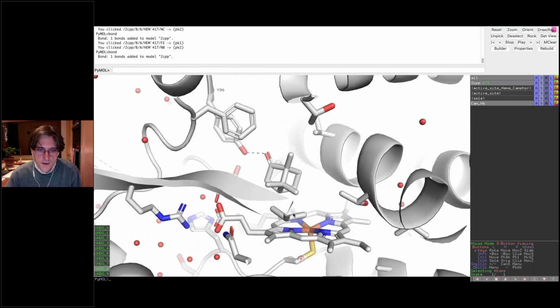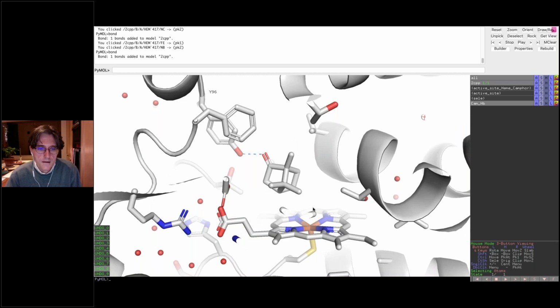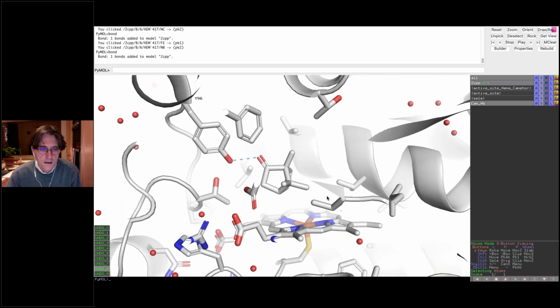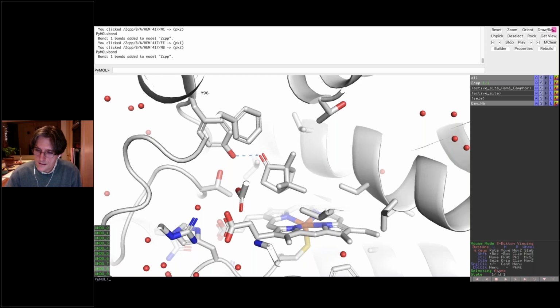So okay, now we've got a view that looks vaguely all right. We've got some things that are appearing in the front clipping plane, which is not always so good. So what you can do is go back to residues, and we can just click on those things that are being clipped in the front plane here, and just hide those.